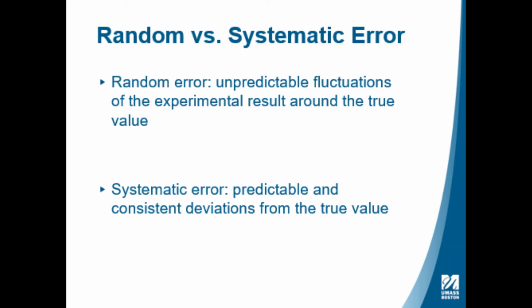However, that might not be the case in the melting point data given to you in the datasheet on Blackboard, so please look carefully at those melting points and those melting ranges.